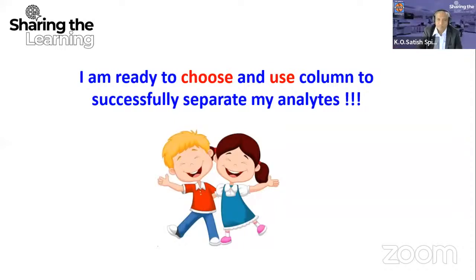So another question again from Pooja. How do we prevent the unequal pathway in the column before analysis? We normally use spherical polymer based columns, where the particle size should be around 3 to 5 microns. So another query from Mr. Balaji K.S. What is the range of theoretical plates for a 5 micron column? If the column is 25 centimeter length, it should be around 15,000.